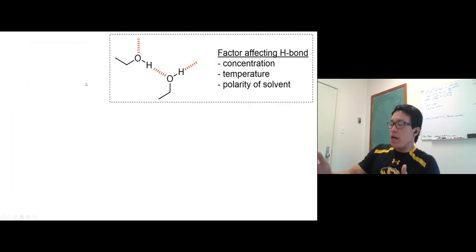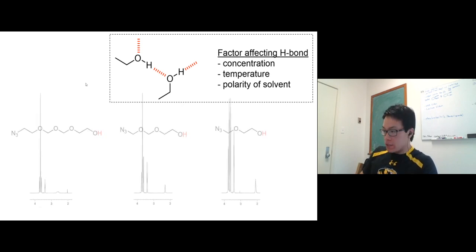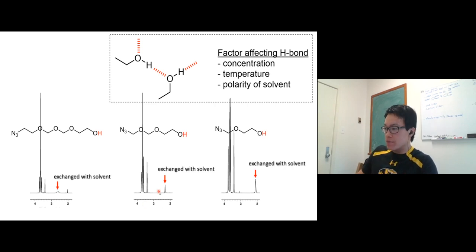That's because of the strength of the hydrogen bond, but I'm not going to get into the detail. I want you to be able to identify that's the signal of the OH or NH. Similar to IR, if you remember, the peak of OH is usually broad. Let's take a look at it on a proton NMR. Slightly broad. Look at that right there.